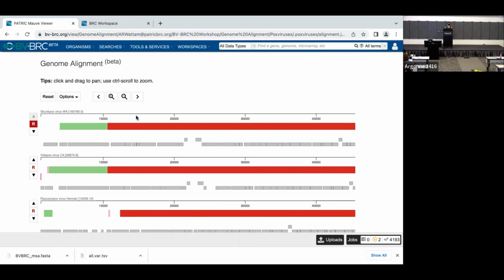Yes, question. You cannot search for it, but you can find it. You can get a sense of where it is, because this will tell you the position on this particular contig. And so if I know that, I can go into the feature page or the protein page for any of these genes, and I can see where that gene is. And I know it's on this contig around this position because it gives you a start and stop. And so using this, I'm able to find it. And then there it is, the anchorin protein, just where I wanted it to be.